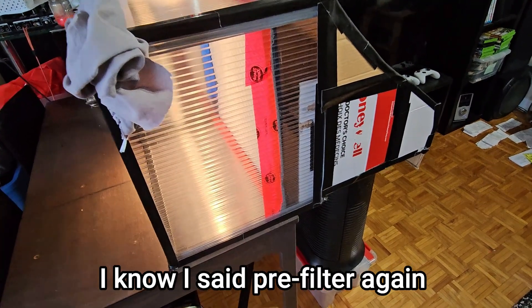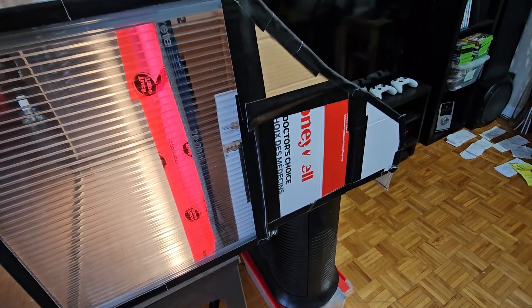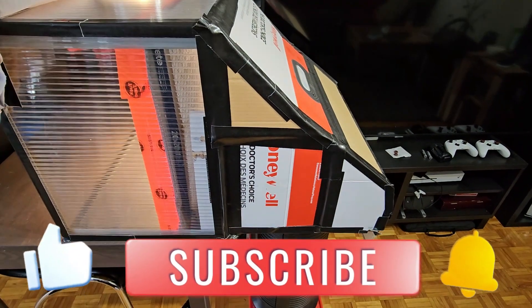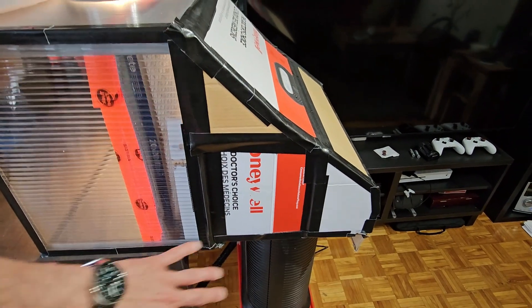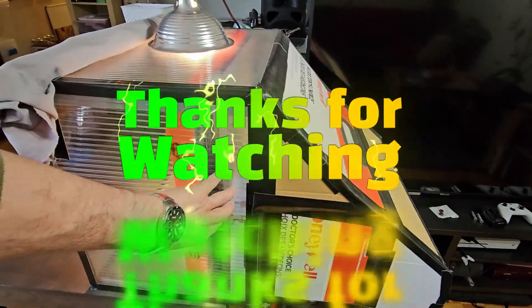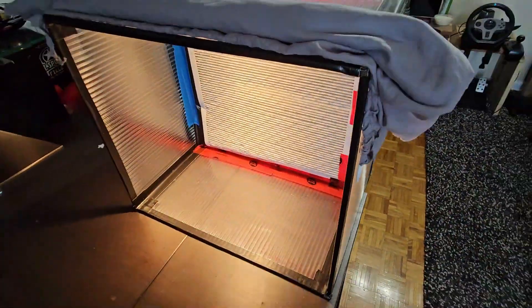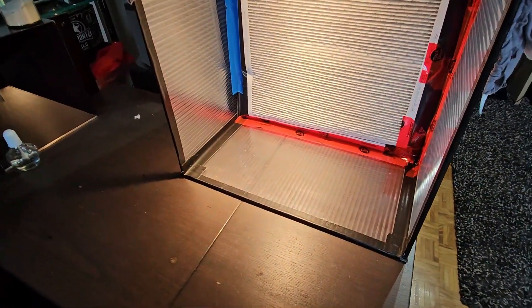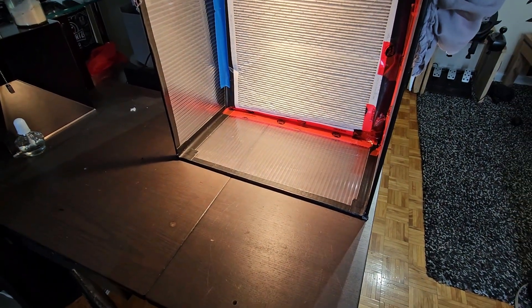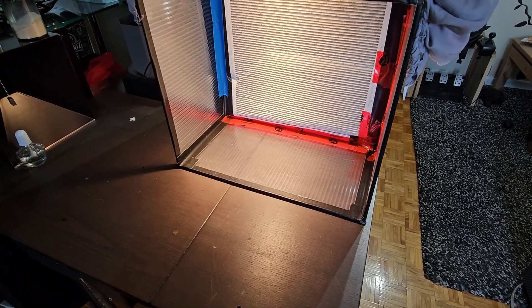That's about as simple as it gets — the $350 air filter, the box it came in cut up and taped into a triangular shape to scoop the air, building up behind the pre-filter so it comes through evenly. I have a 99% success rate with all my cultures with no bacteria or contamination. It works absolutely great. If you have any questions, drop me a comment — I'm always happy to help out.